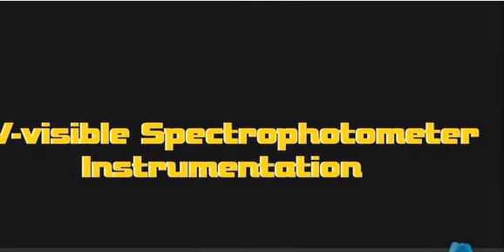Coming to the radiation source. What is the radiation source in a UV visible spectrophotometer? Generally we use a combination of a hydrogen deuterium lamp with a tungsten filament lamp.